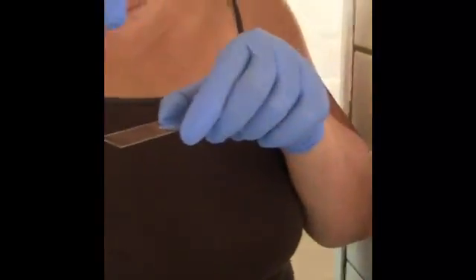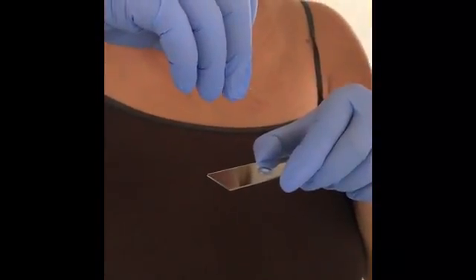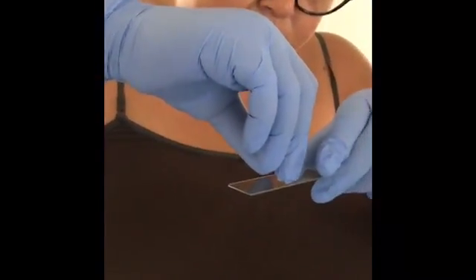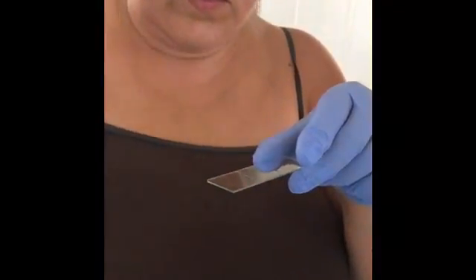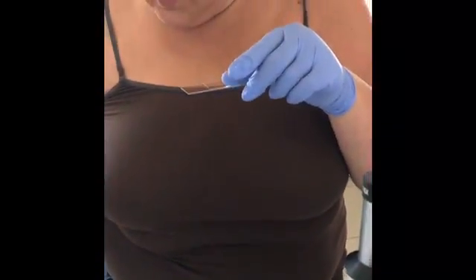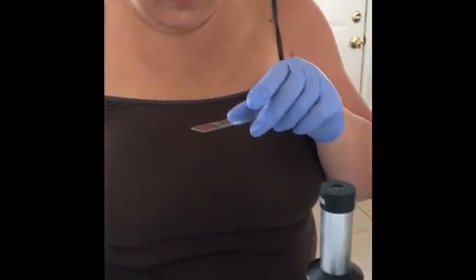As the drop of water comes in contact with the cover slip, the water will wick along the junction of the cover slip and the slide. There it goes. Slowly lower the edge of the cover slip onto the water droplet. If there is excess water, place a paper towel at the edge. But I'm pretty good right now, as you can see. This will further flatten the wet mount slide.